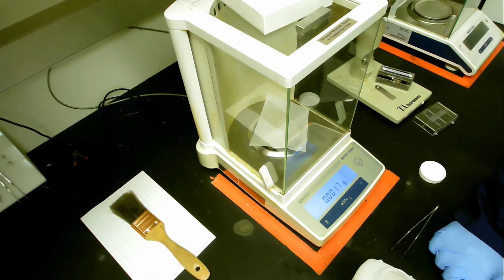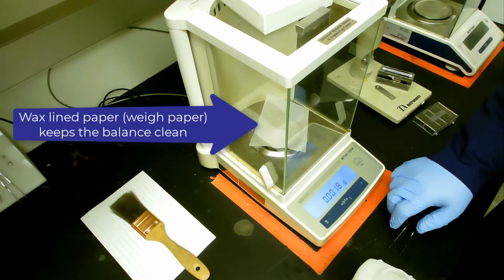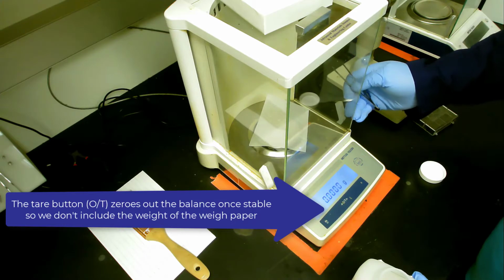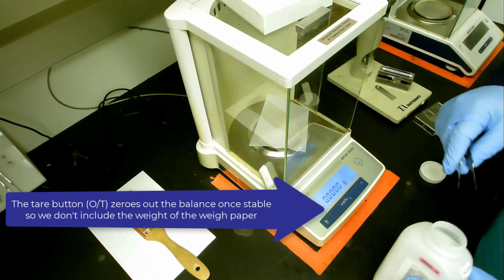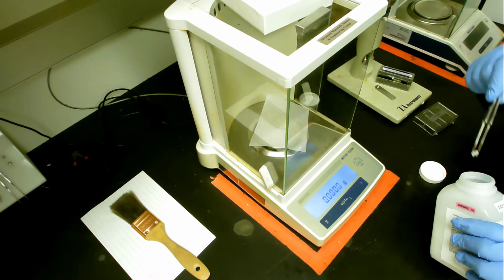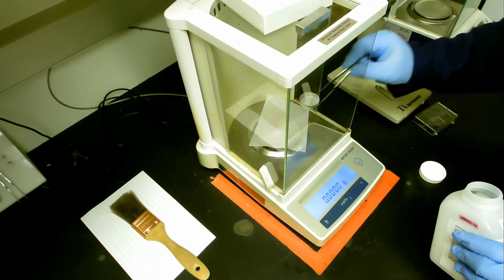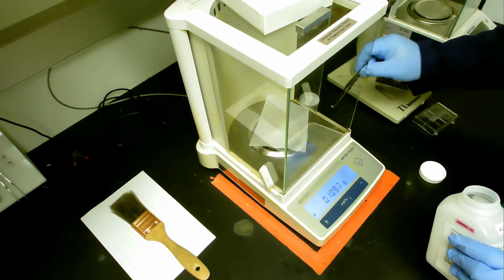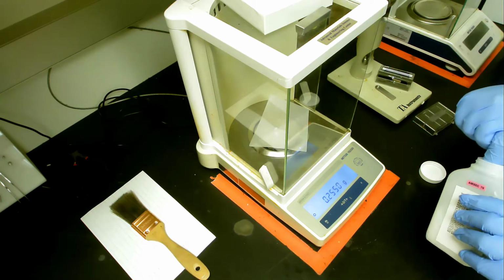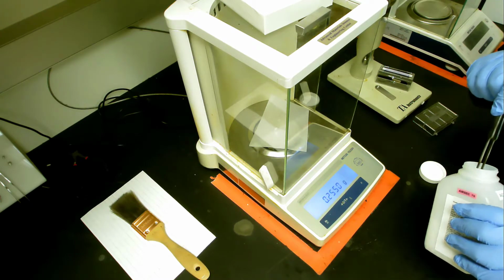Now we are going to weigh out our sodium hydroxide using one of our analytical balances. The analytical balances are very sensitive and have 4 points after the decimal place. An important thing to be cautious of when using sodium hydroxide is that it starts to absorb moisture from the air the longer that you have the bottle open, and then it gets sticky, which causes it to easily be transferred about because it sticks to every surface.